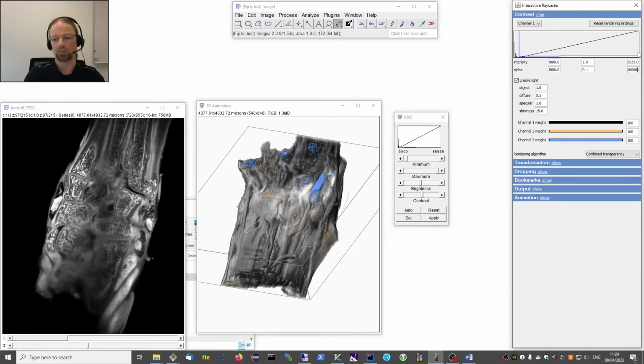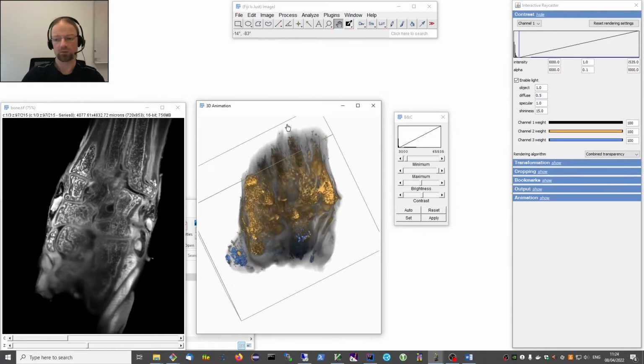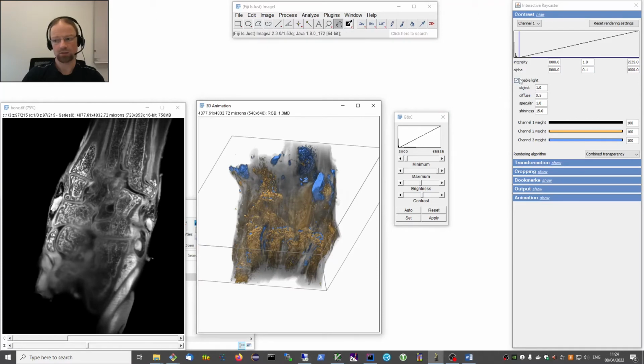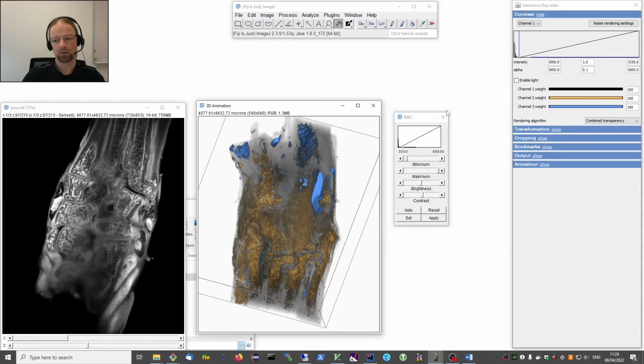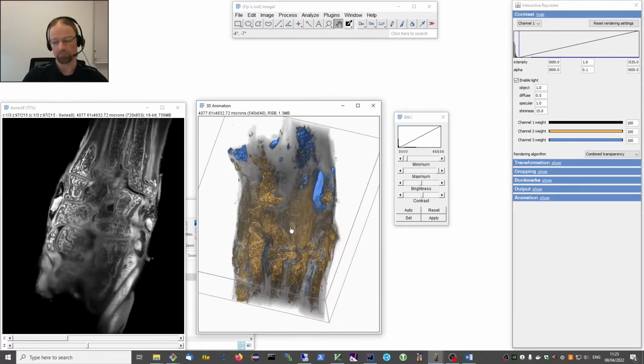And at the same time you can see, if you look at the rendering here, that the outcome gets more transparent. So something like this I think looks very nice. It helps to have the light still on because we see some texture actually. So you can see now when I remove the light it looks rather flat, which might also be fine, but if we enable it we see some of the surface cues here, which is quite nice actually.